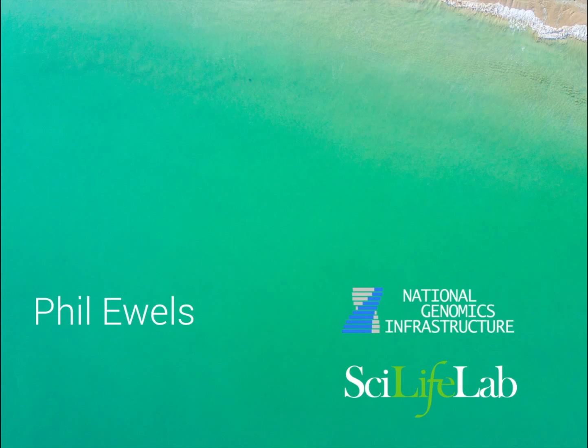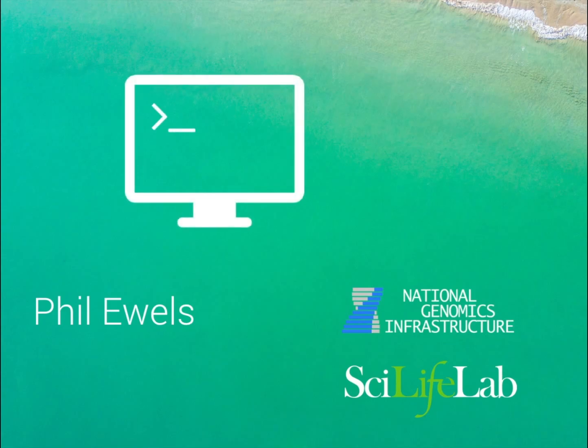We process projects from research groups across Sweden of all different types, and as well as the library prep and sequencing, we also do bioinformatics analysis for groups to a descriptive level. Part of that involves doing lots of quality control to make sure that the data that we send to users is of high quality. When I started at SciLifeLab, much of that was done by reading results from text files through the command line.